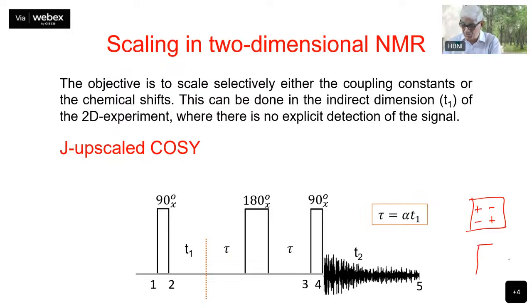In the diagonal peaks, we had this sort of a situation. This is the cross peak and this is the diagonal peak. We had in-phase peaks, but they were dispersive in character, so they used to add in a way that we lose resolution in the spectra. To circumvent this problem, we also discussed a new variation, called the double quantum filtered COSY.